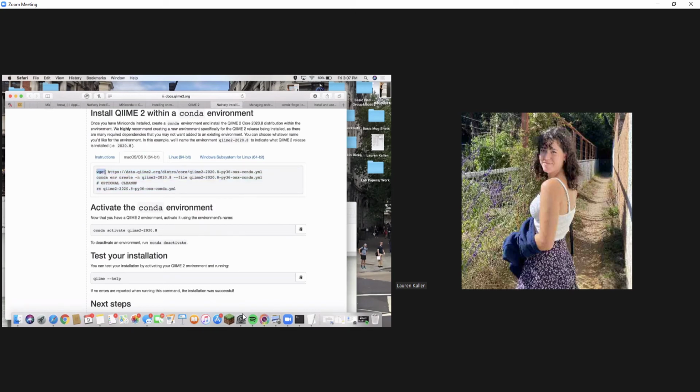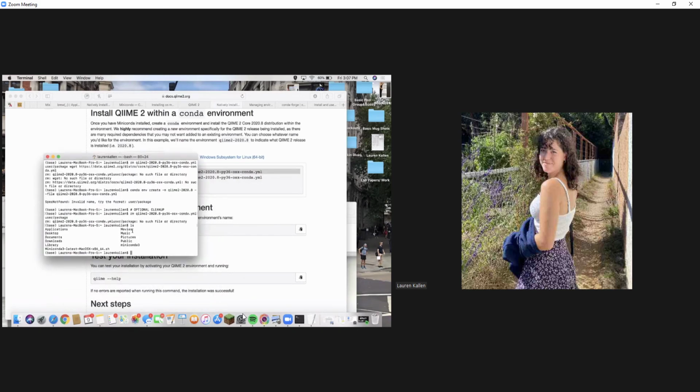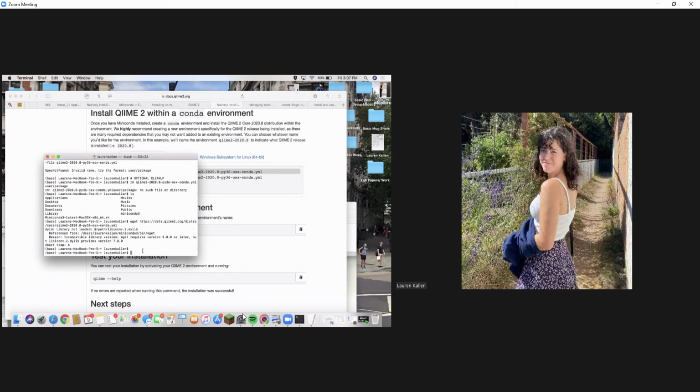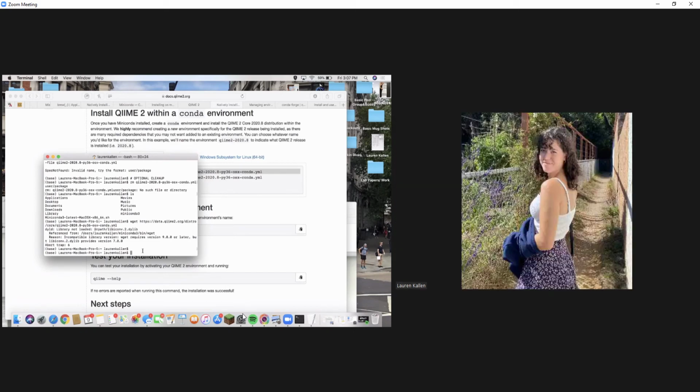Let's just run that, the whole line. Okay. What did it say? It says library not loaded. It's requiring a later version. Okay, so just copy that error and Google it and see what they say.